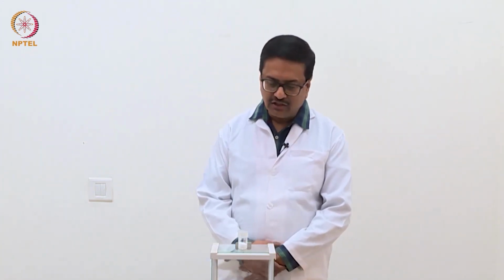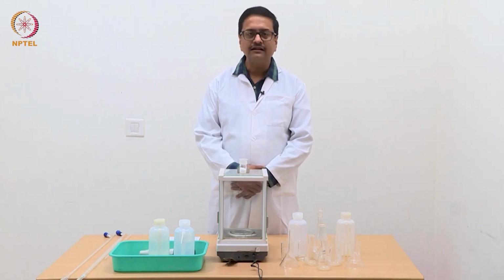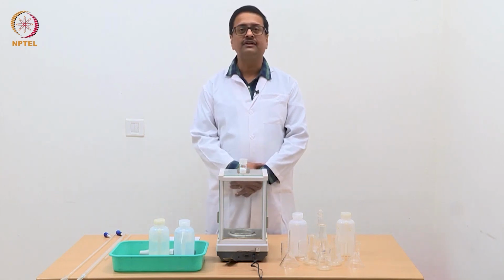As we have discussed during the theory course, we will talk about some of the experiments related to electrochemistry. Today, in our first experiment, we will demonstrate the pH based titration, that is potentiometric titration, of strong acid versus strong base. Then we will continue with weak acid with a strong base, and the third experiment will be the titration of weak dibasic acid. We will use oxalic acid as our dibasic acid and do a titration using NaOH.